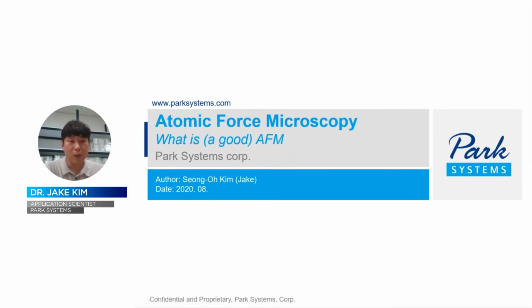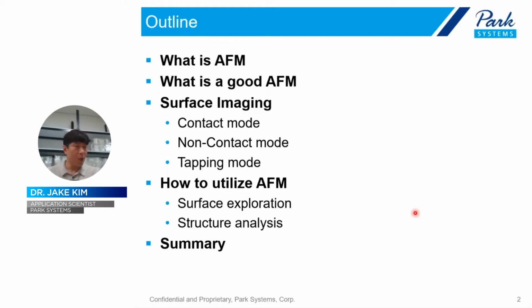Okay. As I said, today I'm going to talk about the Atomic Force Microscope. What is a good AFM? So here is today's outline. First of all, I'm going to talk about what is a good AFM, and after that, I'm going to talk about the AFM surface imaging, the imaging modes. And after that, I'm going to present how to utilize AFM.